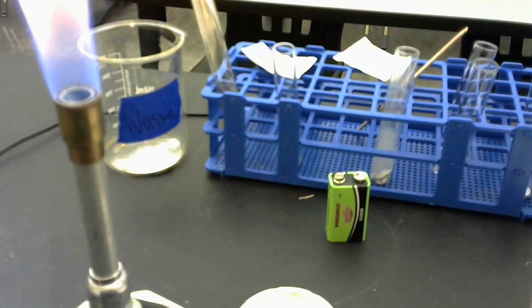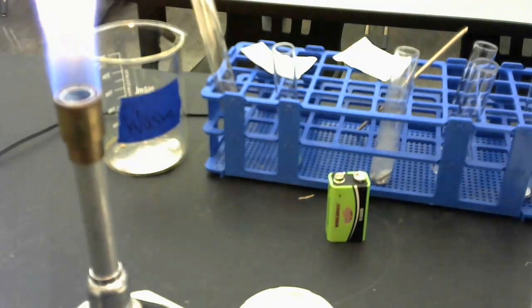Now, when I light hydrogen gas on fire, it is going to react, it's going to explode. And the reason it's going to explode is because hydrogen gas is going to react with the oxygen gas in the air to produce water. Okay, so that's another example of a reaction that's not on your sheet, but it's H2 plus O2 yields H2O. So that's actually going to be a synthesis reaction or a combination reaction, okay? So that was reaction type C, number 2, okay?